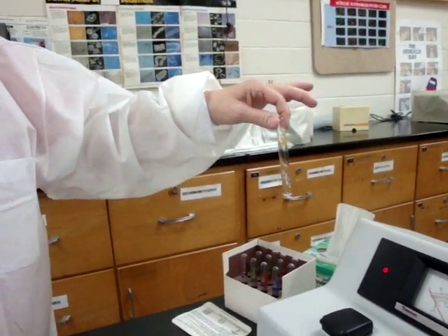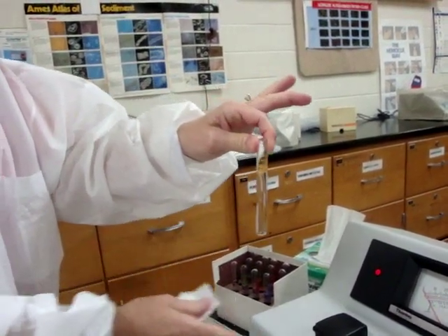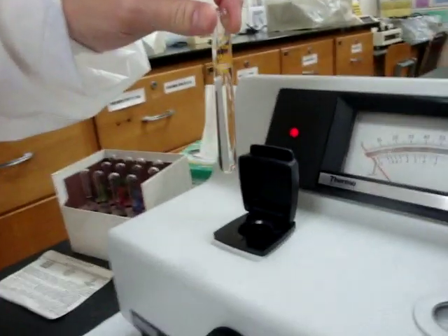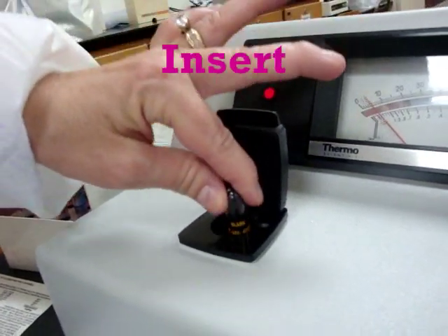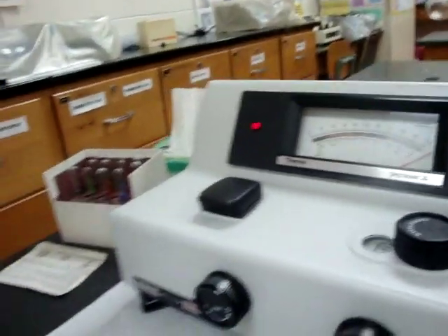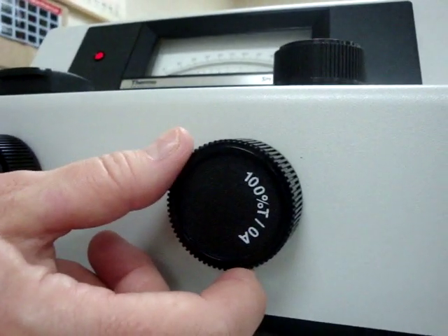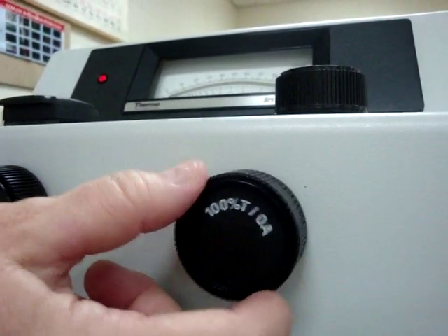Now insert the blank. Wipe any fingerprints off the tube, open the sample compartment door, place the blank in, and close the lid. The next step is to set the percent transmission to 100% using this knob, turning it until it hits 100 percent.